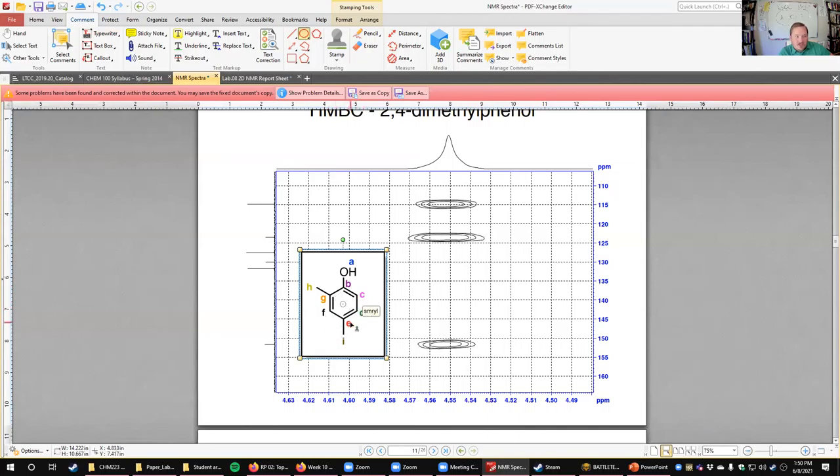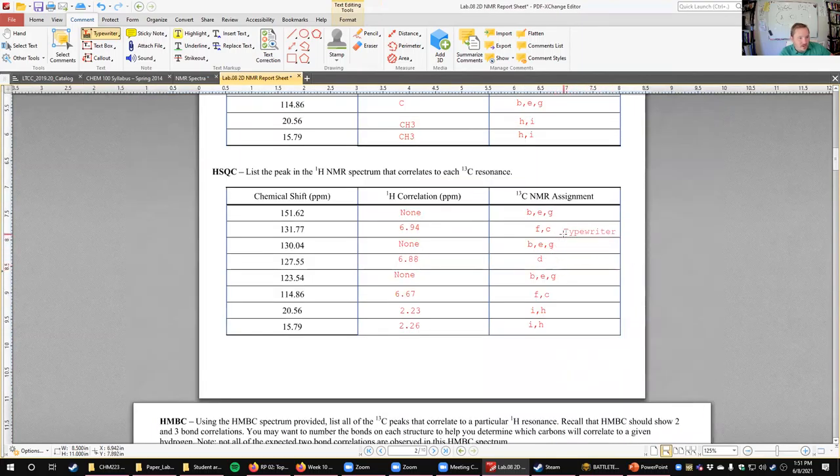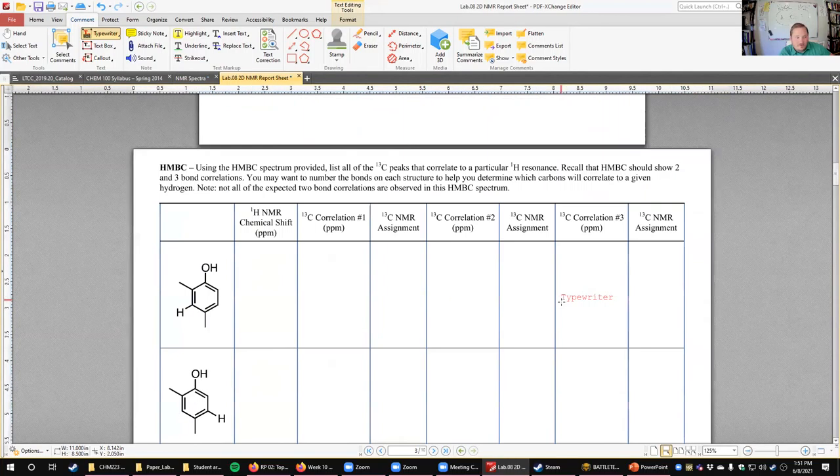All right, so the fact that we have those three grouped is going to change things because only one of them has a hydrogen, right? So out of our previous group where we were able to say, okay, well, I know that F, D, and C go together, and G, B, and E go together because they either have protons or don't. C is the only one that has a proton and is within three bonds of the oxygen. So this basically allows us to assign C.